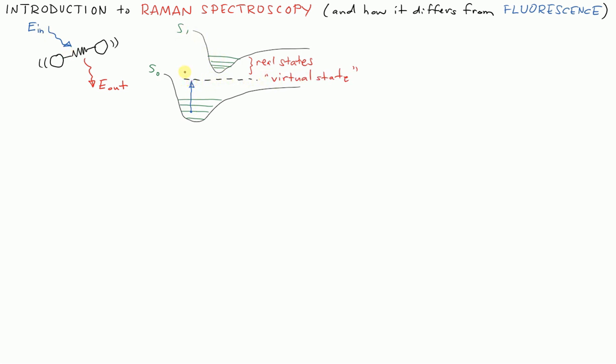And the way that the molecule gets out of that state is to immediately emit a different photon. It could decide to go right back to the incident state that it started from and come all the way back down to here. That would be elastic scattering. But sometimes it emits down to here. And you'll see that we've now got an energy difference between the incident and the final state.